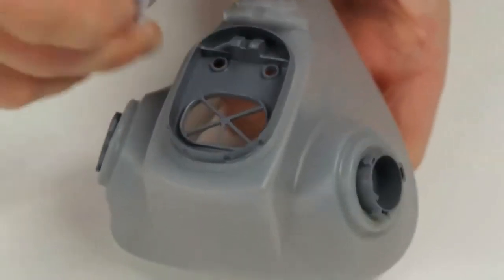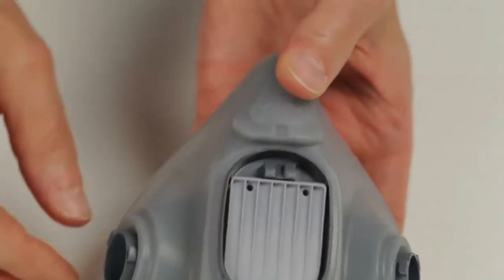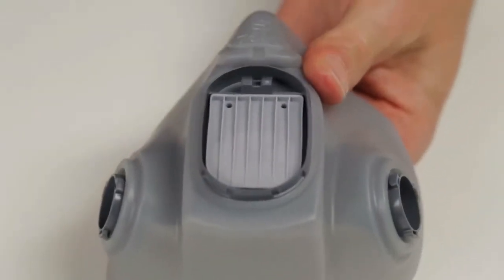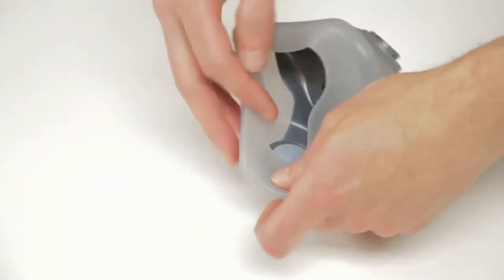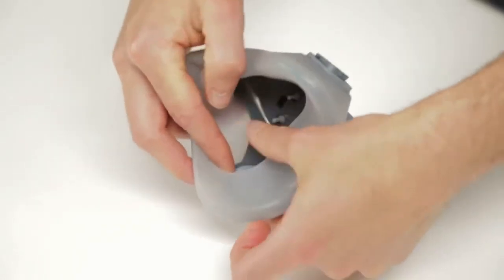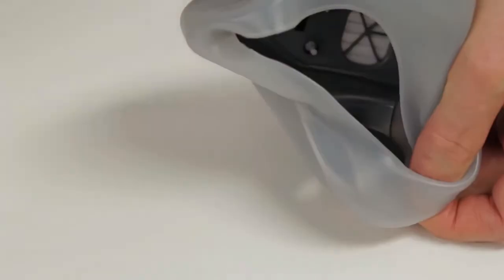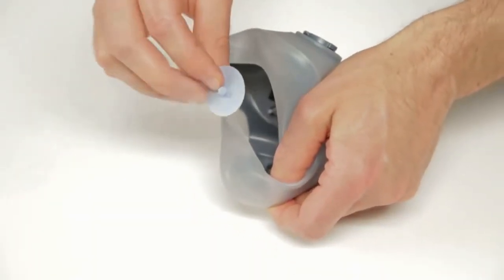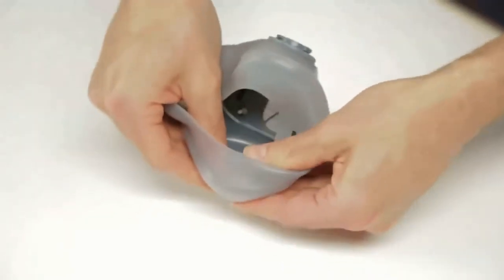To replace the exhalation valve, insert the stems into the 2 holes until they are visible from inside the facepiece, and then pull the stems through until the valve is securely seated. Replace the exhalation valve cover as you did before. To remove an existing inhalation valve, grasp the valve and pull the valve stem out of the valve seat. To replace the inhalation valve, press the valve stem into the hole and manipulate the valve stem from inside the facepiece until the valve seats completely.